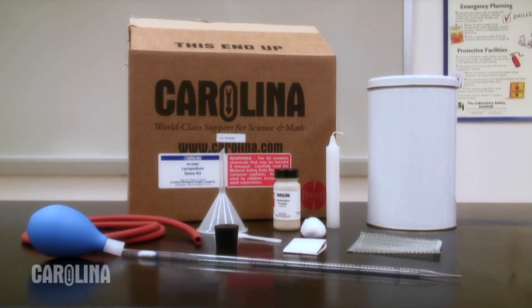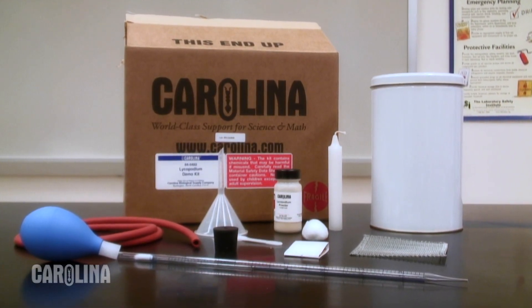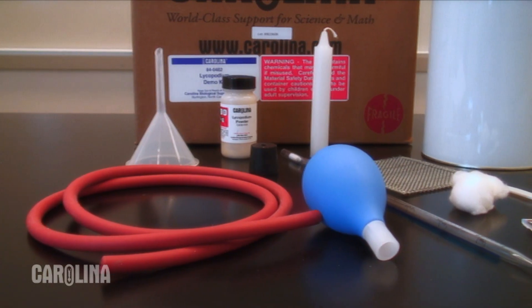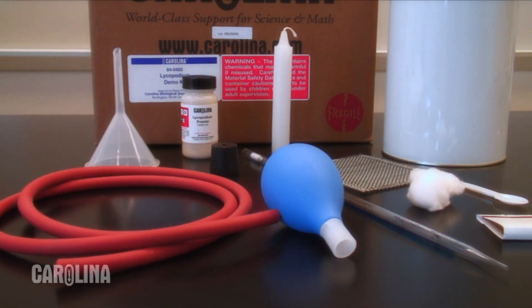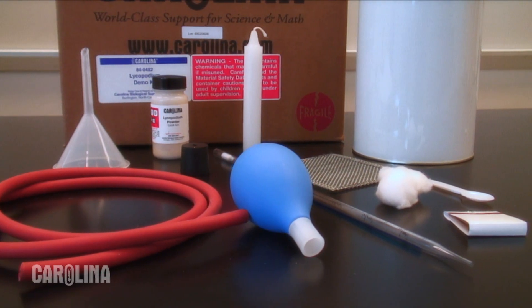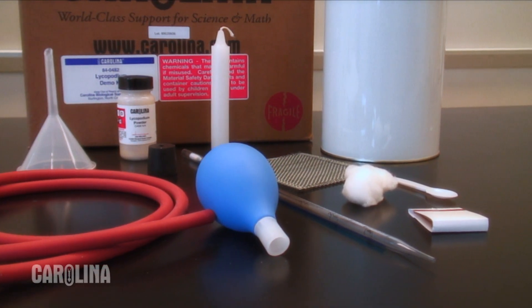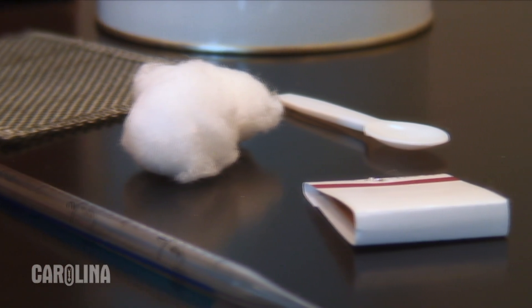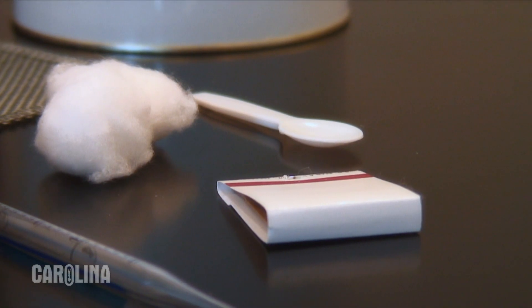Everything you need for this demonstration is available in the Lycopodium demonstration kit from Carolina. This kit contains a funnel, rubber tubing, a rubber bulb, a pipette, a candle, a can with a one-inch hole drilled in the bottom, a wire screen, cotton, spoon, matches, and a ring stand or tripod.